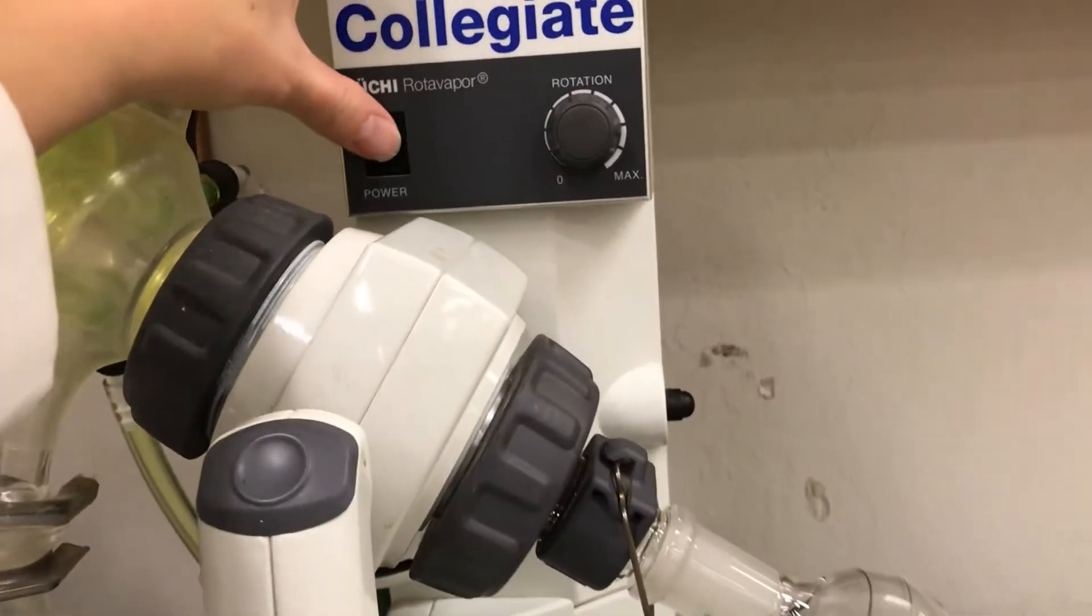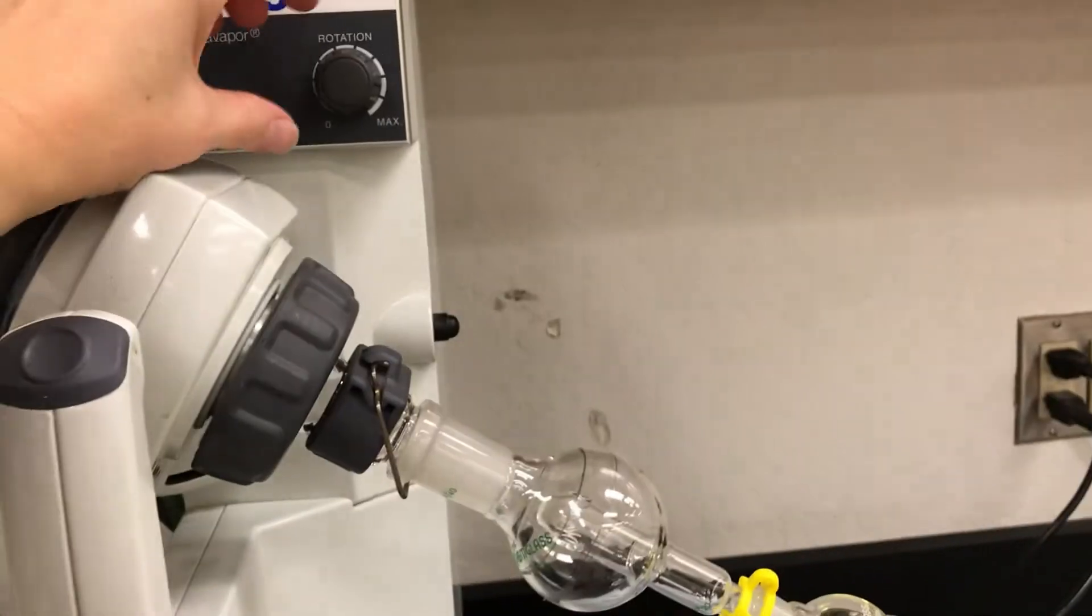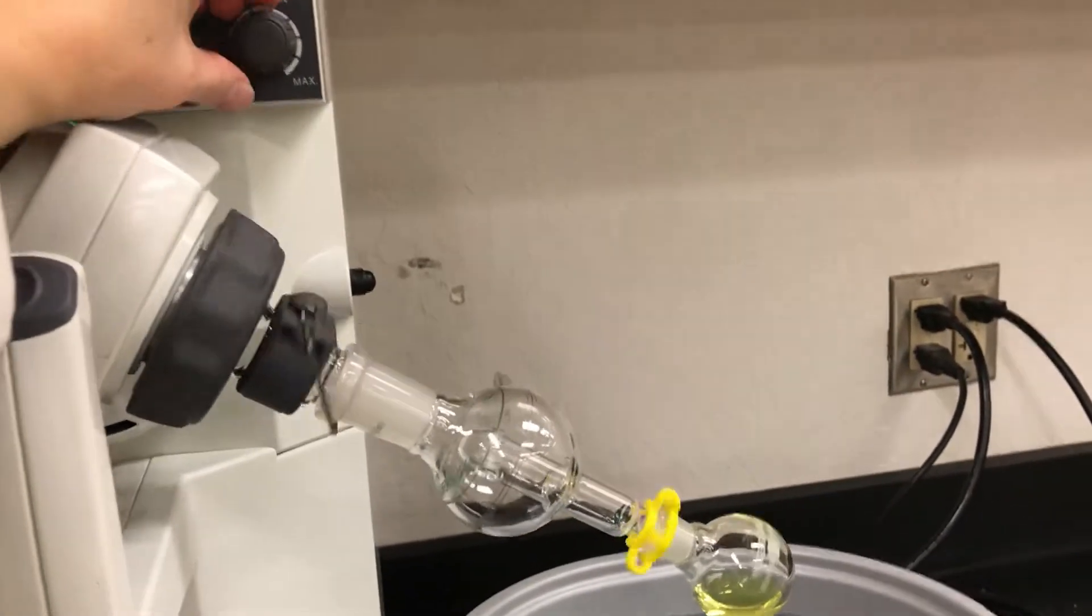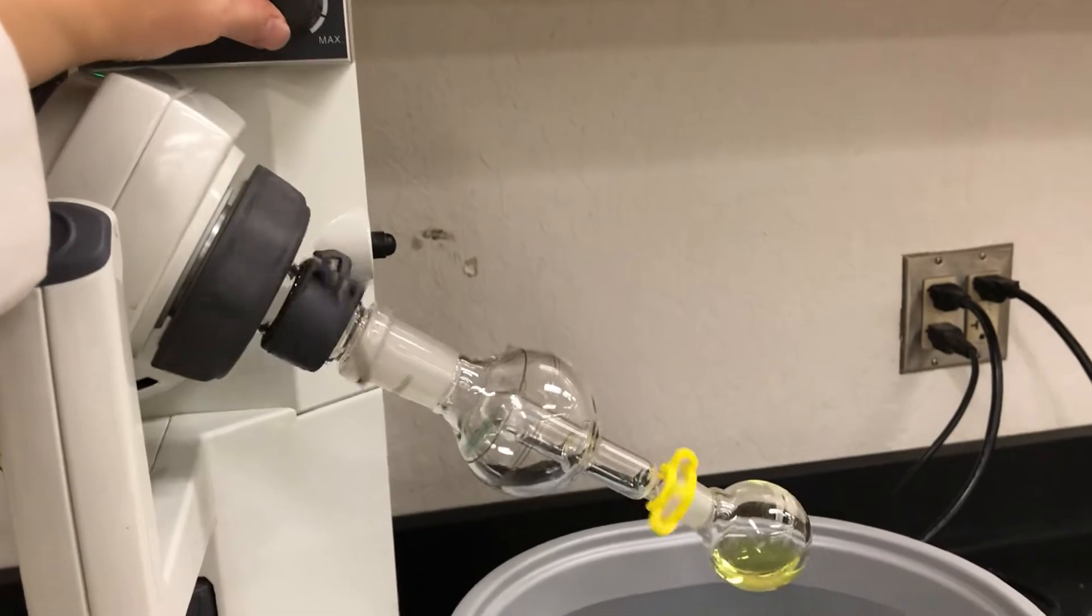Next I'll turn on the rotavap and then turn the rotation dial to start rotating the flask. Rotation makes evaporation faster and it also makes it less likely to bump.